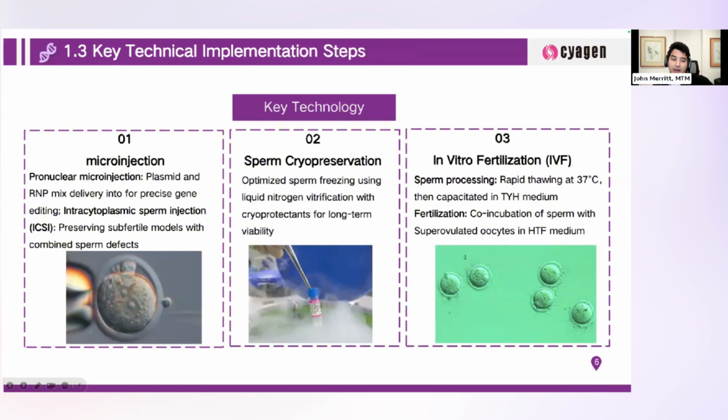So on our end, what happens is we first start off with scanning through literature and finding genes of interest. We find genes that are being studied by scientists. And then in our facility, we design guide RNAs and do the vector construction, perform the pronuclear microinjection, and then generate the F1 heterozygous mice in our facility, and then we do the quality control.